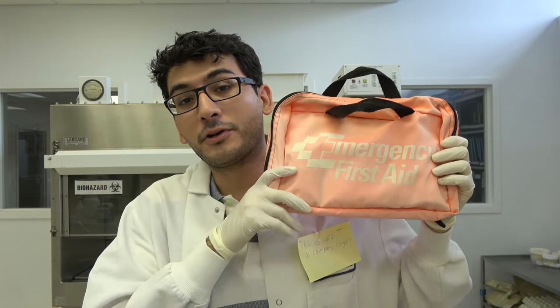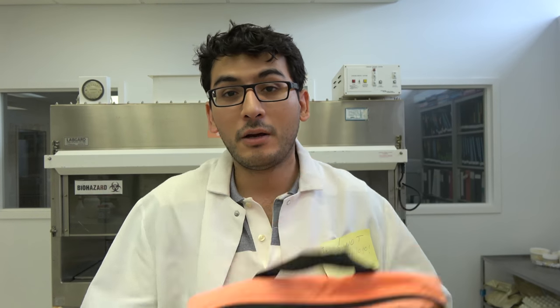Rule number three. Always know where your emergency first aid kit is. Put it somewhere where everyone can easily find it. It's not obstructed by anything. So that if you're an idiot and you burn your hand, you know exactly where to run. A lot of labs also have showers, like eye washes, stuff like that. I don't have that here. Rule number four.